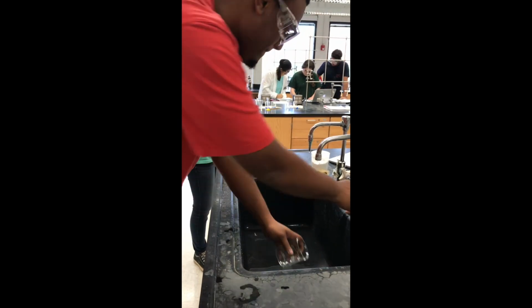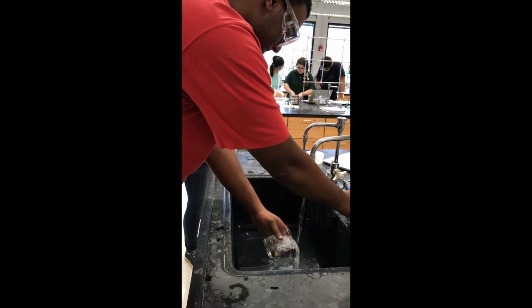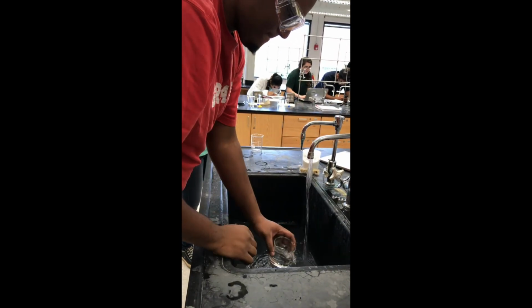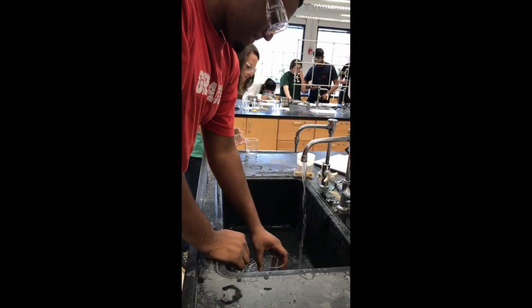And of course, we couldn't leave this week's lab without cleaning up our lab area. All of our solutions and dilutions could be safely poured down the sink, so we poured everything in the cuvettes and everything in the beakers down the sink. Next, we just washed them out with water, and then we dried them off and put them back where they belong.